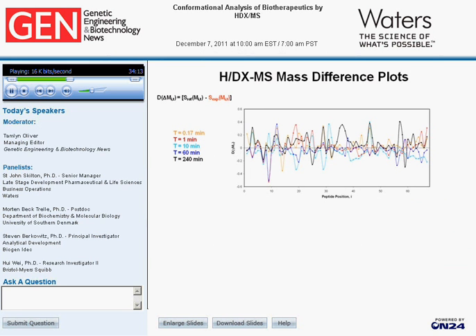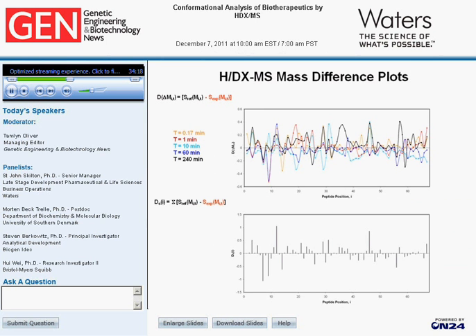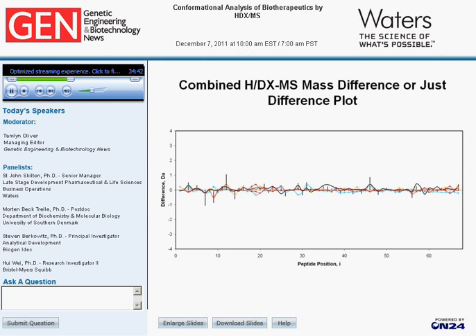Now, what we can also do is plot some of the total exchange. In other words, each data point for a peptide, each time point is summed, and we get the total sum of difference as indicated at the bottom here. And instead of putting these as individual data points, we're just going to plot them as bar plots. And by doing that, we can then combine both these data points, as shown in the next slide, so that we have the individual data points as little points connected by different color lines, each line color corresponding to a particular time point, and then the bar indicating the total sum of differences for that peptide. So you can see obviously data can be positive, can be negative. Next slide.